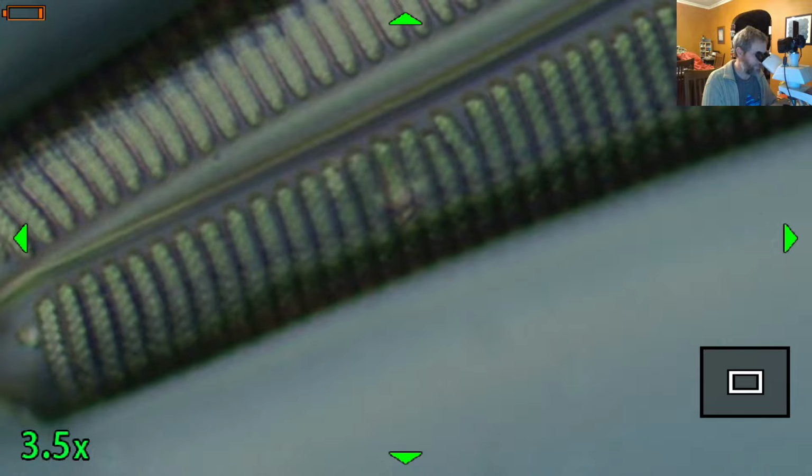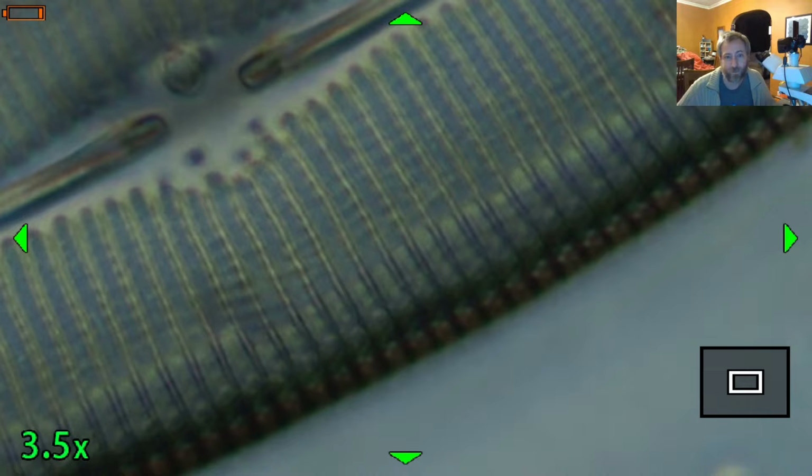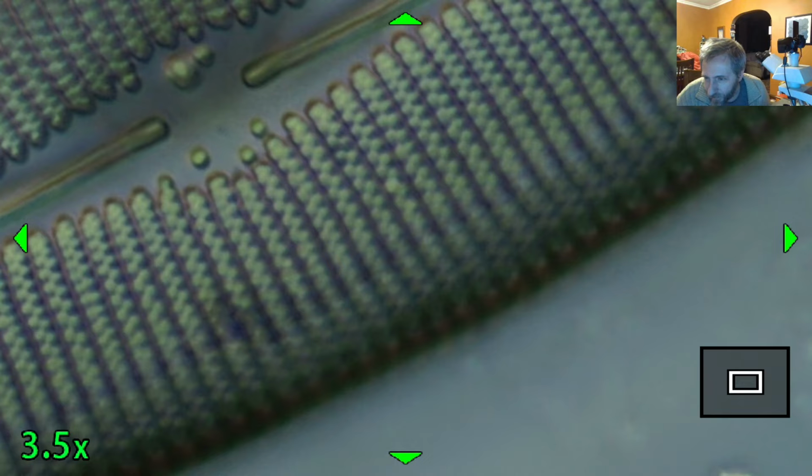Immersion oil, yeah. These are like immersion oils. I'm using Immersol, but the minerals aren't floating in the oil like those are. But we've got a refractive index in the epoxy here. That makes the diatoms stand out a little bit better, which is what those immersion oils from mineralogy class were trying to do: make different minerals stand out by using the refractive indices to highlight certain components. We're doing the same kind of thing. Some of the pores in the SEM were nearly circular perforations. You'll see that.